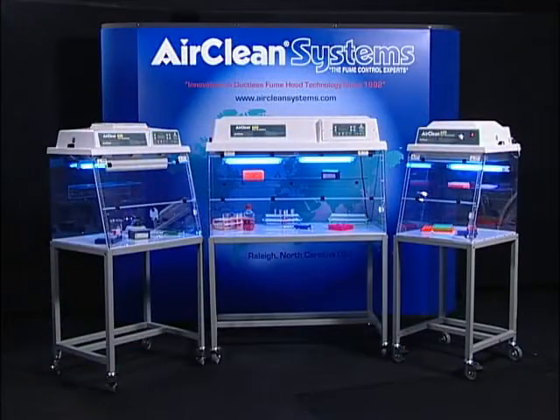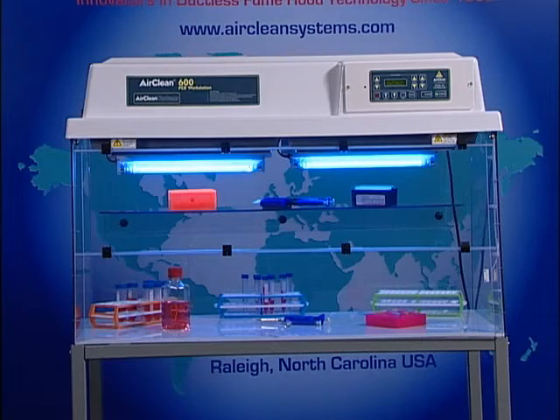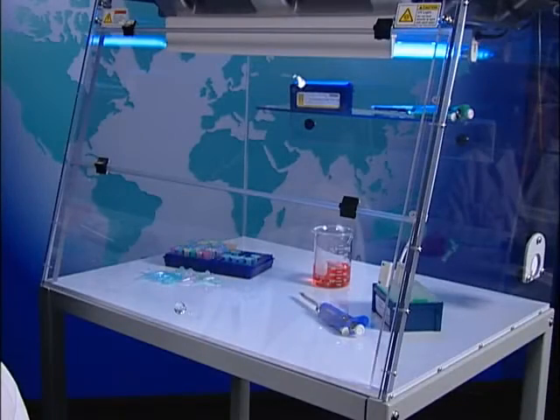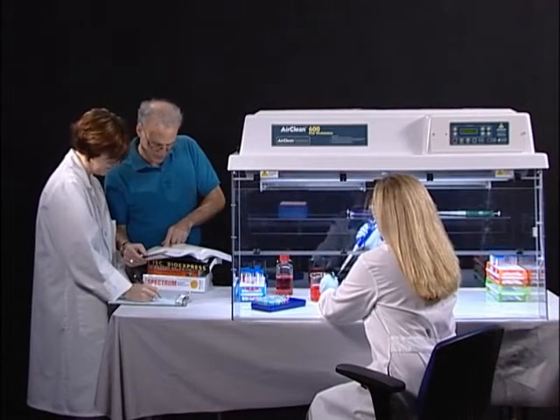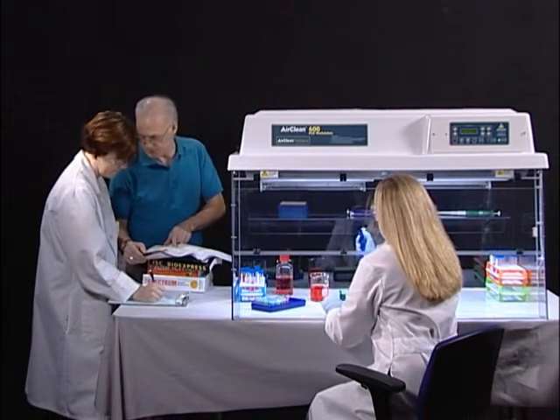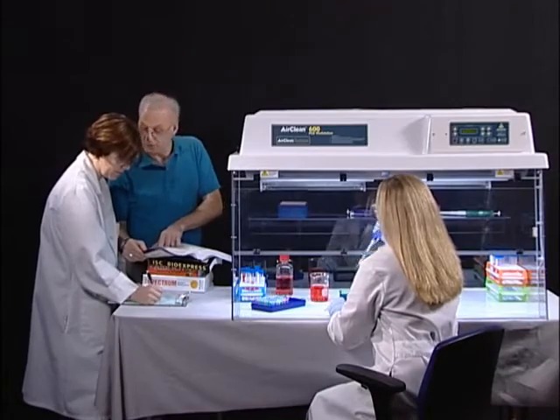AirClean Systems offers the combination workstation in three different widths — 24, 32, and 48 inch — with a standard 24 inch depth. AirClean Systems combination workstations allow the operator to create a mini clean room on the laboratory bench. By incorporating an AirClean Systems combination workstation into your application, you can improve your odds and reduce the amount of reagents required to achieve your desired results the first time.